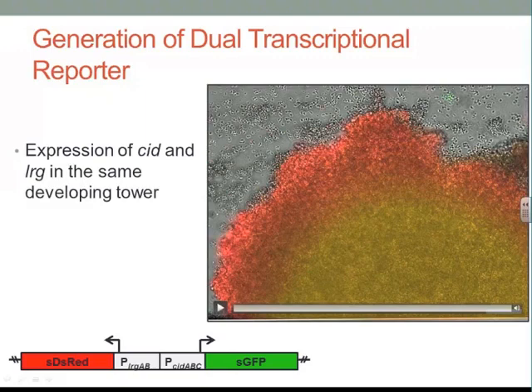In addition to this, which I didn't previously talk about, we also have this small tower phenotype. I know it may be hard to see on your screens, but I'll show a couple more examples later in the talk. What we see are these smaller tower phenotypes that seem to not grow as quickly, and don't divide as rapidly as the large towers that we constantly see during our normal growth period.